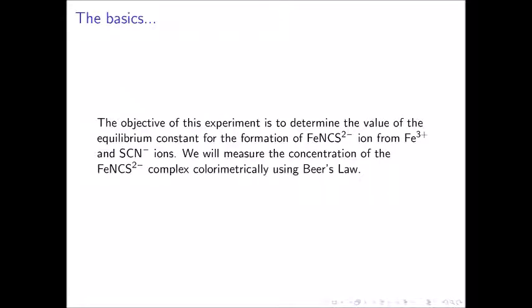The objective of this experiment is to determine the value of the equilibrium constant for the formation of the ferric thiocyanate ion from iron 3 plus ions and thiocyanate ions. We will measure the concentration of the ferric thiocyanate complex colorimetrically using Beer's law.